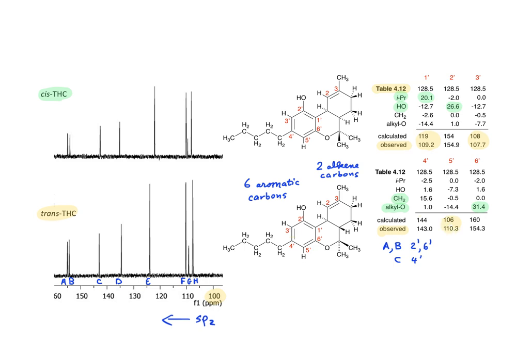but F, G, H look like they could fit these 3 peaks, and in particular G, without an NOE, corresponds with what we would expect for the 1' peak, so that F and H are 3', 5' without necessarily assigning them.